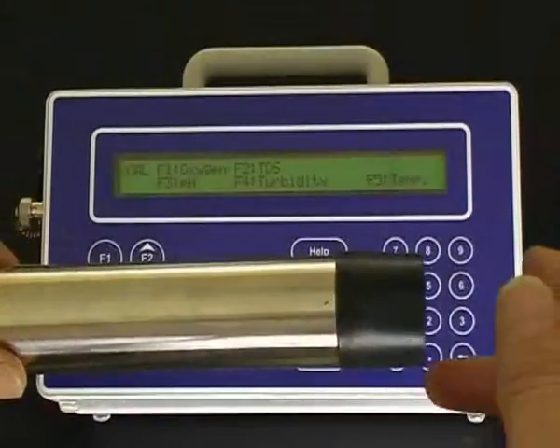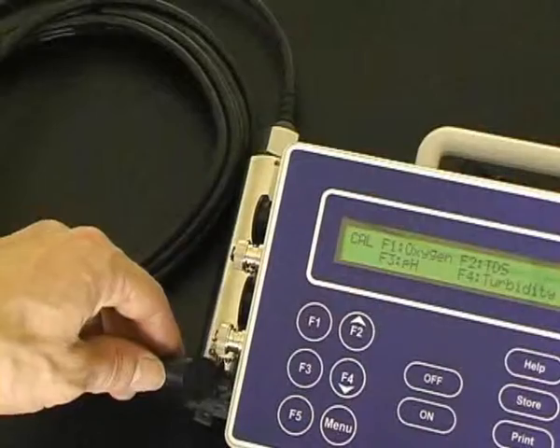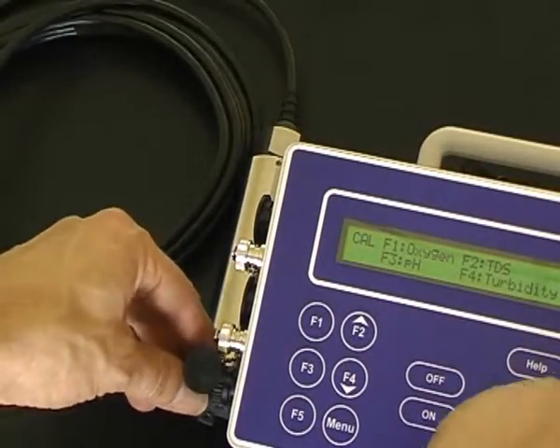The turbidity sensor. First, the protective cover must be removed from the sensor. Connect the sensor to the turbidity socket on the 90 FLT.